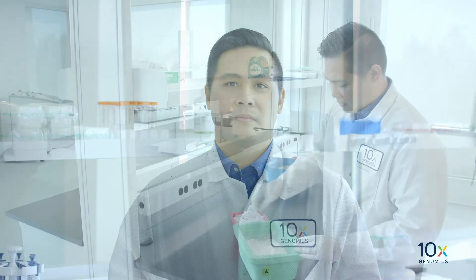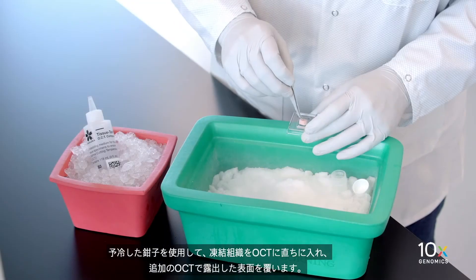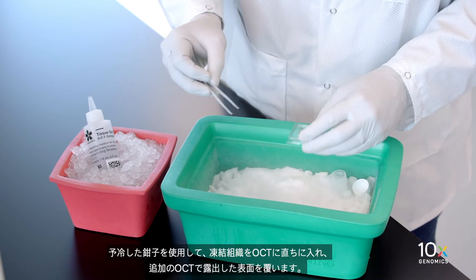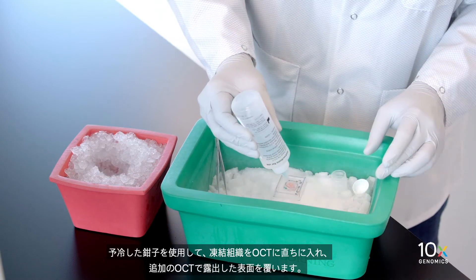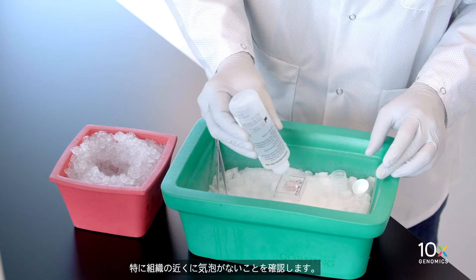Now we can OCT embed the frozen tissue. Using pre-cooled forceps, immediately place the frozen tissue into the OCT, covering any exposed surfaces with additional OCT. Confirm there are no bubbles, especially near the tissue.